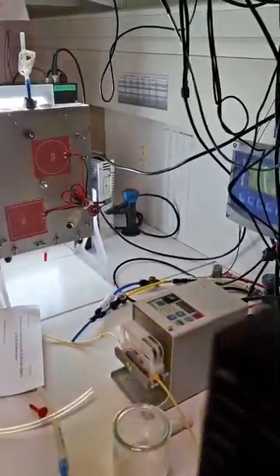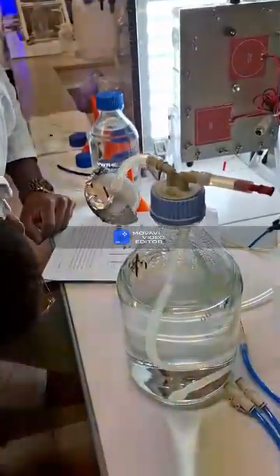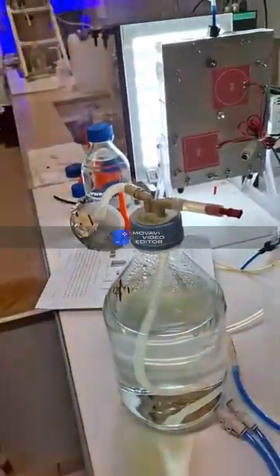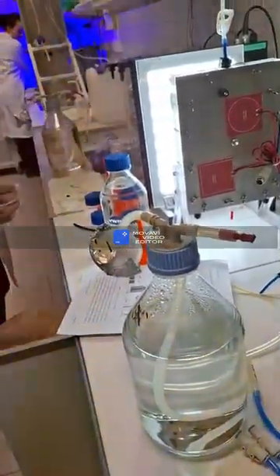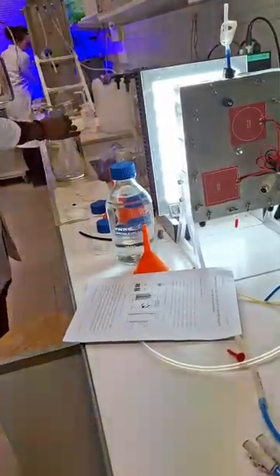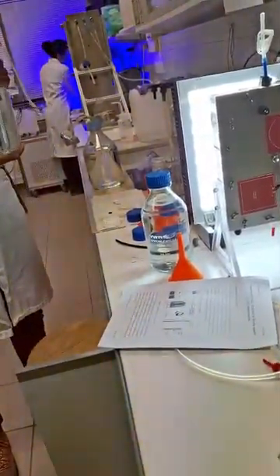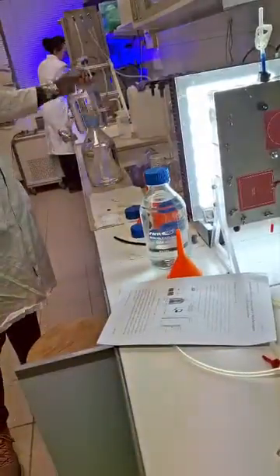Here I have some material. This is the 7.5 pH. Is this media already prepared? No, it's just water for the moment; that will become media for this one. And this one is just autoclaved distilled water, to rinse after the peroxyacetic acid.